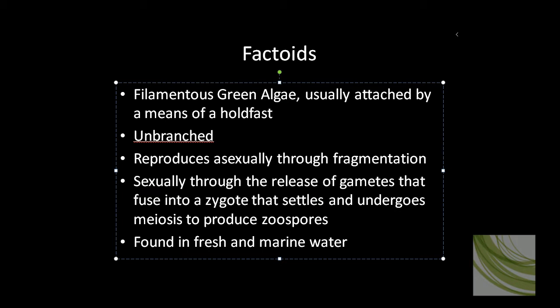Sexually, the parent cell will release gametes. They'll fuse into a zygote that settles and undergoes meiosis to produce zoospores. Found in both fresh and marine water.